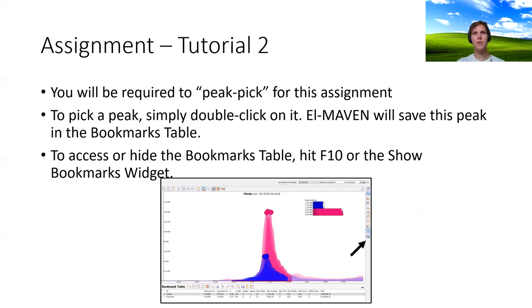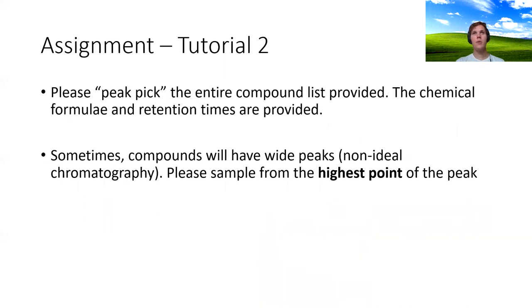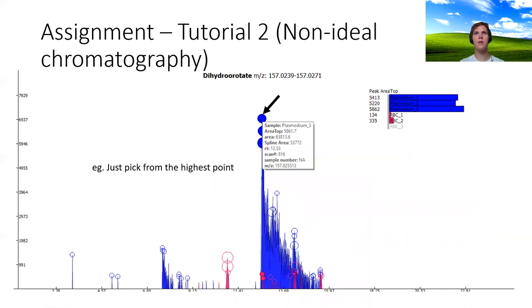For this tutorial, you'll be required to peak pick. To pick a peak, simply double-click on it and LMAVEN will save it into the bookmarks table located at the bottom. To access the bookmarks table, hit F10 or show the bookmarks widget. Pick the entire compounds list provided — the chemical formulae and retention times are provided so peaks should be unambiguous. Sometimes compounds will have wide peaks, which is a case of non-ideal chromatography — just pick the highest point of the peak. If there are multiple peaks, choose the one with the correct retention time based on the CSV file.